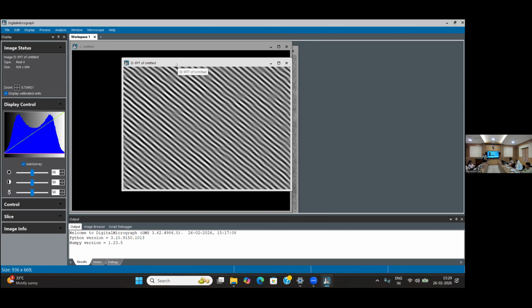some useful images, because some images will explain themselves, like you modified some material and you got this, so you show this image, the image will explain it, the thing that you modified is there, so no need to explain more. For that kind of images, you should explain to the operator, like I am doing this, I am expecting this, then you will get that kind of images that will help you in publishing in high index journals. High quality journals will expect that kind of high quality images. Okay.